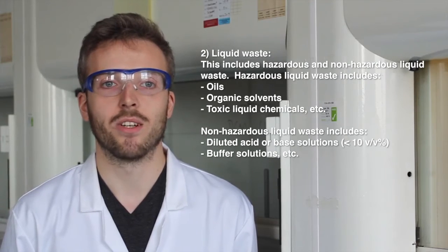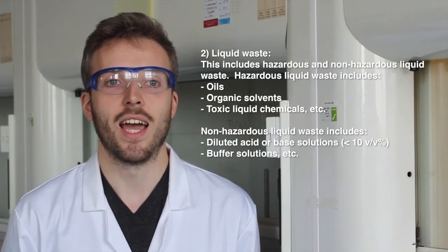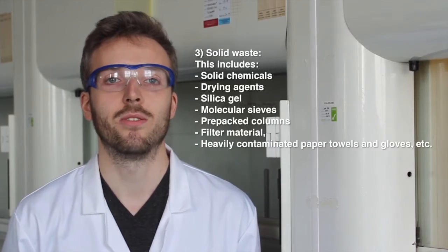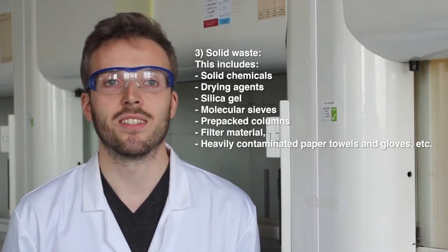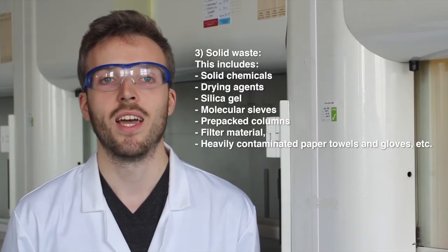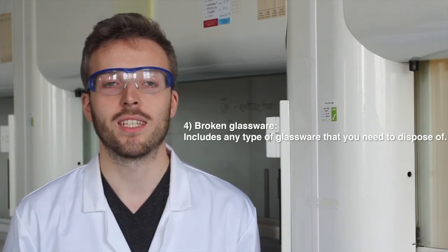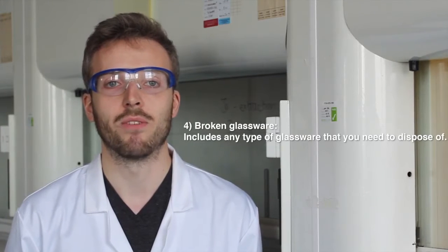Non-hazardous liquid waste includes diluted acid or base solutions with less than 10 volume percentages and buffer solutions. Third, solid waste. This includes solid chemical, drying agents, silica gel, molecular sieves, pre-packed columns, filter material, and heavily contaminated paper towels and gloves.